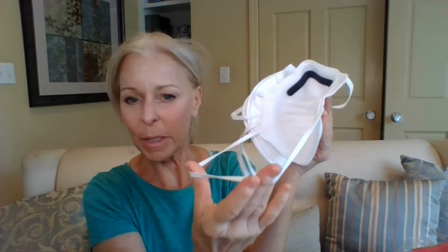For me, and I would think for anybody who's on the more petite side, this bottom strap is quite long. I've got this Indiana Face Mask respirator that I reviewed already and I'm just going to show you — here's the bottom strap from the Indiana Face Mask company, and here's the bottom strap from the Armbrust AA95. I don't know why they made it that generous — it seems like almost nobody would need it that long. That said, there's nothing wrong with bringing it up higher on your head and crossing them. Just do your fit test and see how it works. Thanks again for the ongoing coupon code for Sandy's DIY Health Advocacy viewers with Armbrust at 20% off: Sandy20. Let me know if you try any of these or if you're waiting to find out if they get that NIOSH approval. Until next time, be well. Bye-bye.